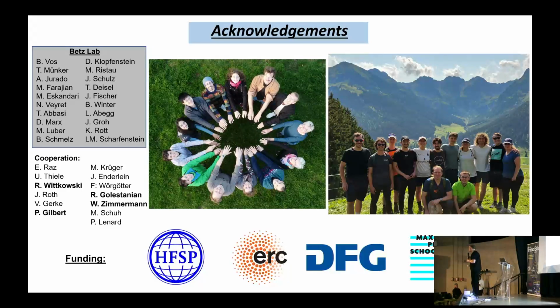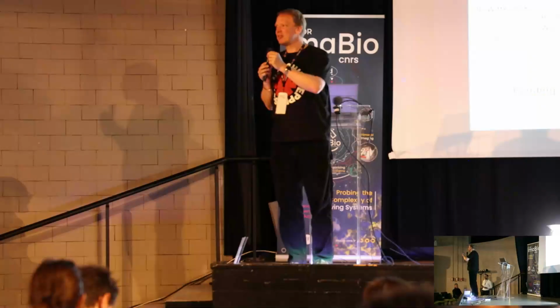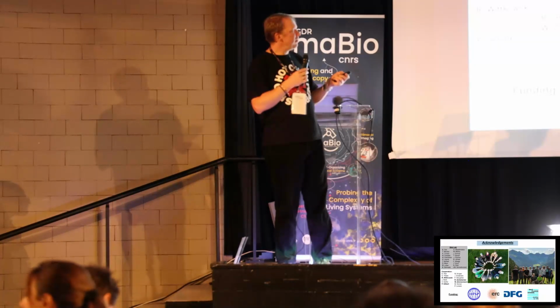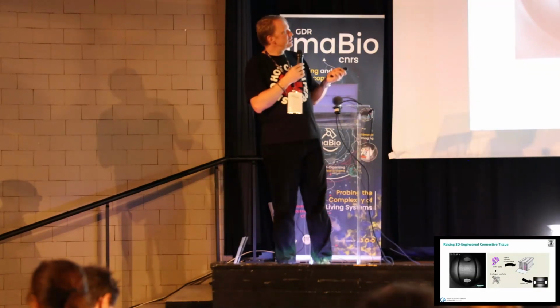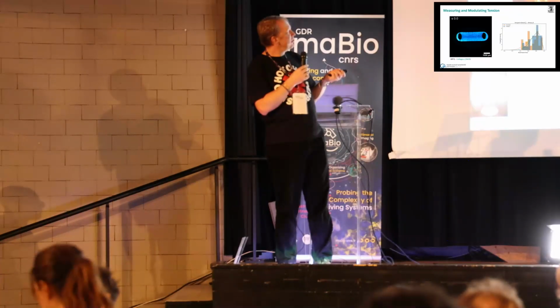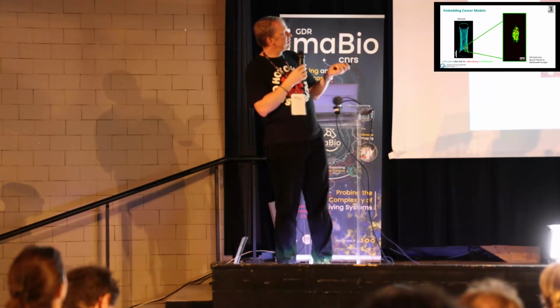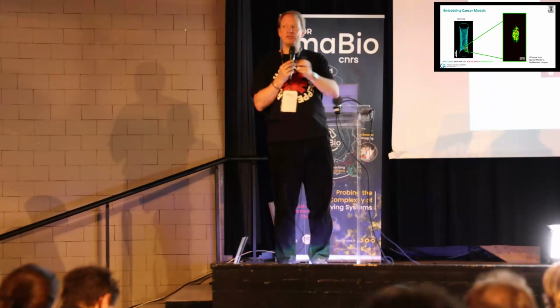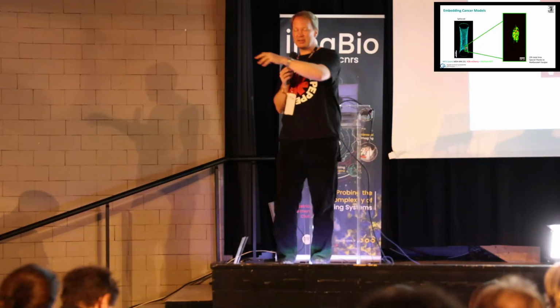Awesome question. We actually started to team up with the clinic. But then we realized that in our new light sheet that we got in Goettingen, we have a hard time making these clusters survive long enough. So we are now switching to the chamber, I also kicked that out. In the chamber we can use fibroblasts to generate this matrix, and then we can add the cancer. So this is a cancer tumor now, but these are again MDA-MB cells. So this is not heterogeneous as you asked for, which is a great question.